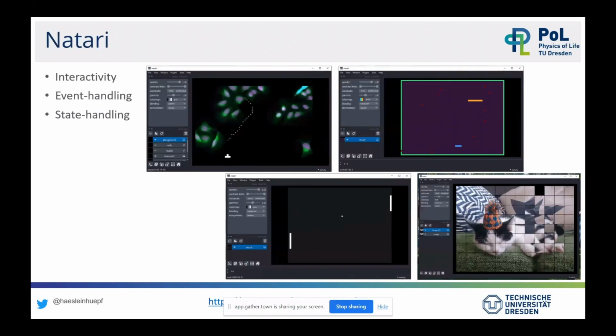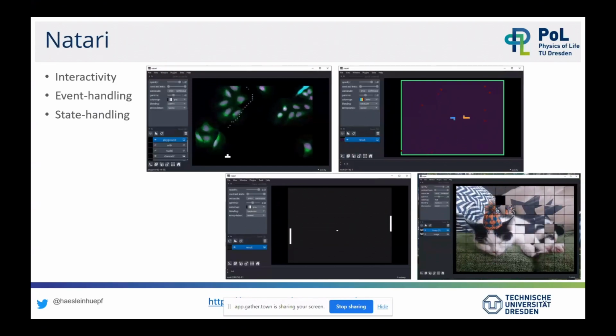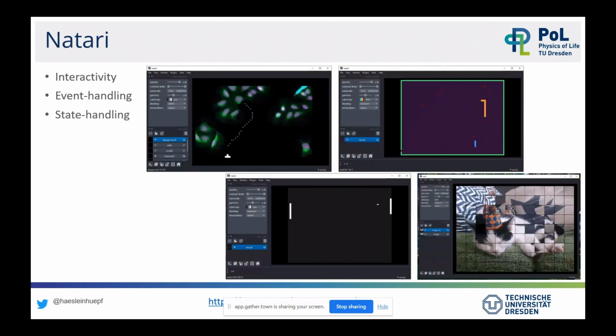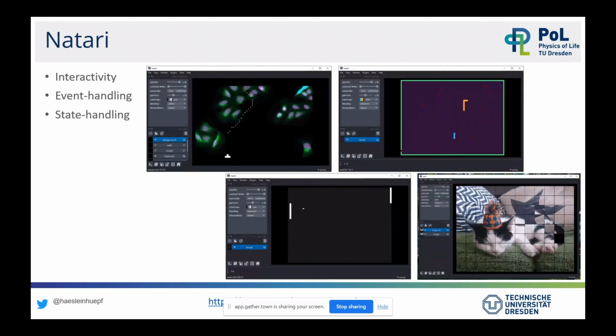There's also some more, let's call them tools available. So if you, for example, want to know a bit how you can work with key interactions or more or less anyway, like updating visualizations in Napari according to a measurement over time, or using the keyboard to control something, I can recommend you having a look in a Napari plugin, which is not 100% serious, but still fun to look into the code and work with it.